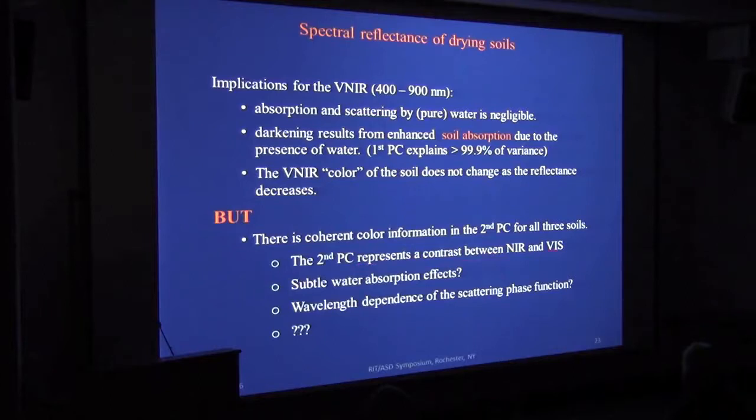It represents a contrast between the near-infrared and the visible. So it's got to be either subtle water absorption effects or some wavelength dependence of the scattering phase function. Or maybe somebody else has another suggestion. No hands going up. I'll wait till the end if you want.